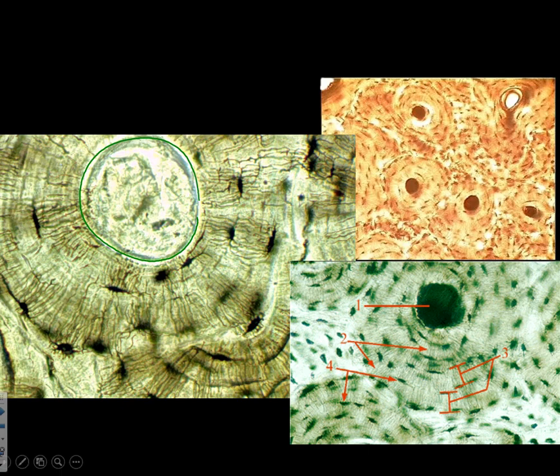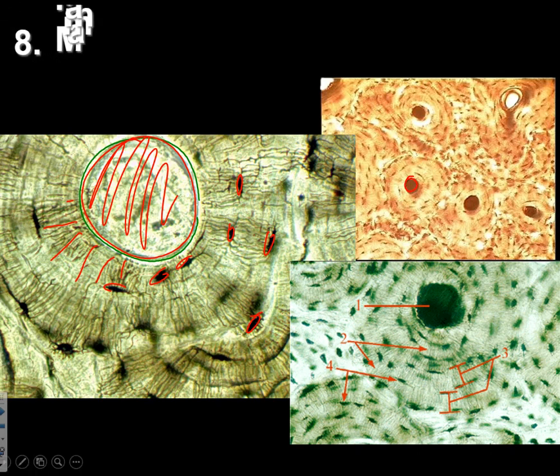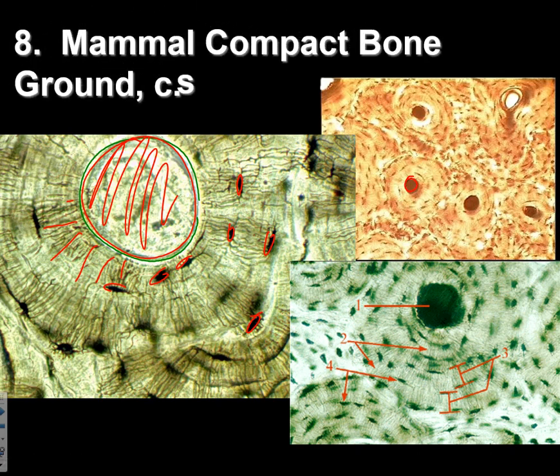Oh, green's not a good color there. Big thing in the middle. Okay. And then we got these little things out here, these little dark things. And we got these little cracks running through here. So what is this? This, my friends, is bone. Cross section of bone.